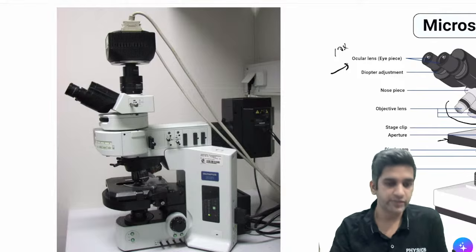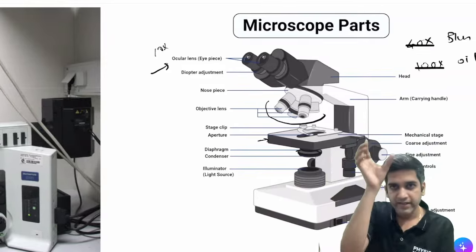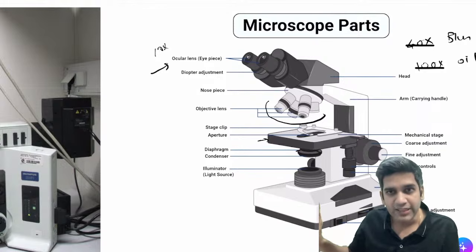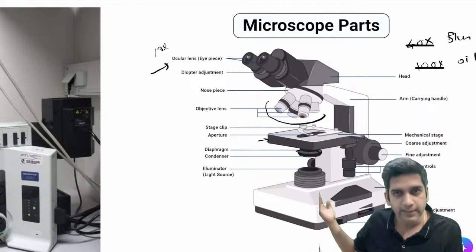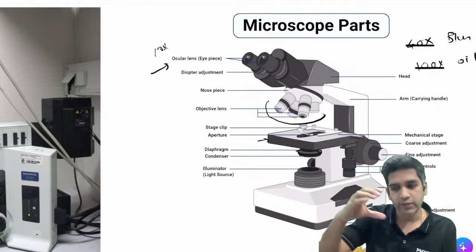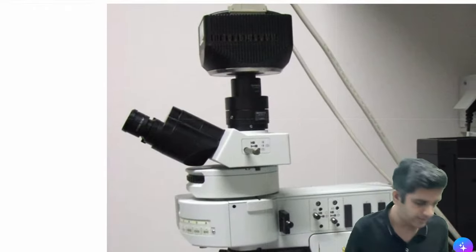There's one important difference. In a light microscope, the arm is straight, and the light, the power LED light or the normal sunlight, comes from the bottom, right? And then you'll have an eyepiece. So here also I have the same thing. I have an eyepiece.